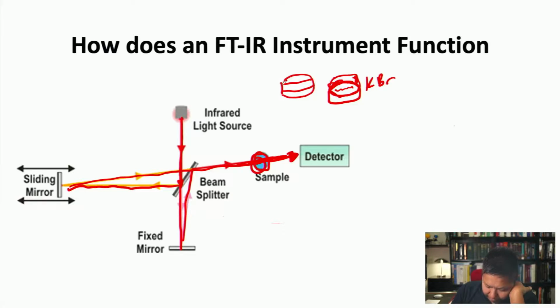And it's in between two KBr windows. Right? And that's what actually would go into the sample holder, with your sample. But that was so cumbersome, and I'll tell you why.